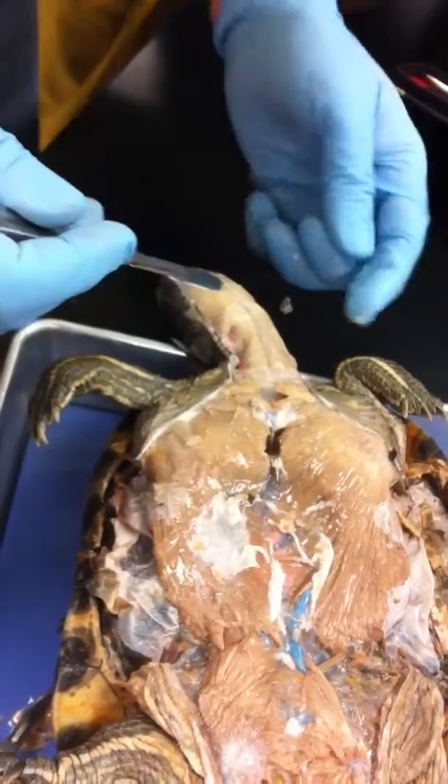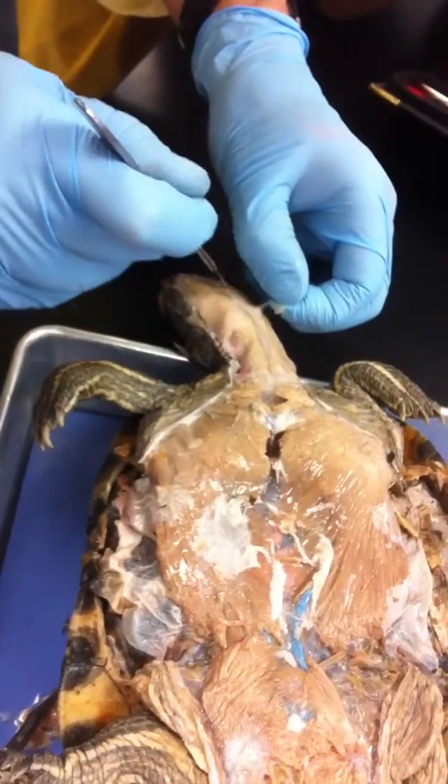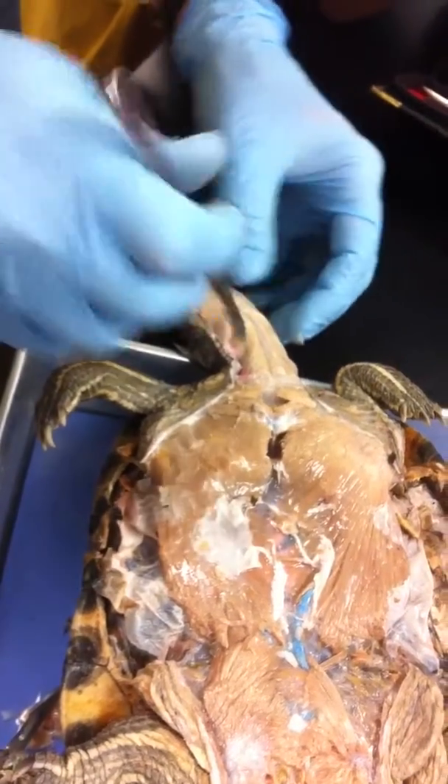The trachea is corrugated — like cardboard. It's got little rings on it.